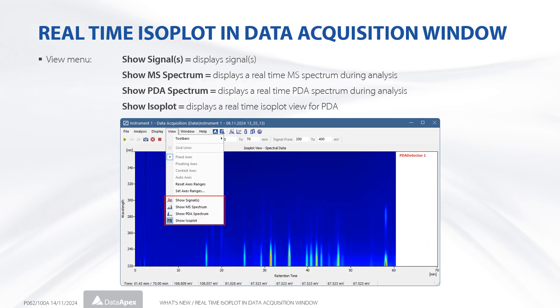The data acquisition window allows for real-time monitoring of measured data. Now it can also display the PDA isoplot in real time. The view menu has been rearranged to enable smooth switching between the signal, spectra, and isoplot views. The PDA and MS spectra and isoplot views are available in the corresponding extensions.